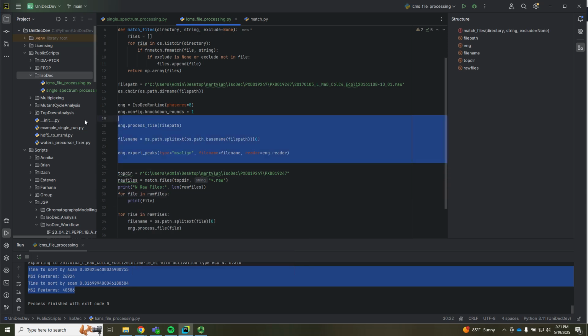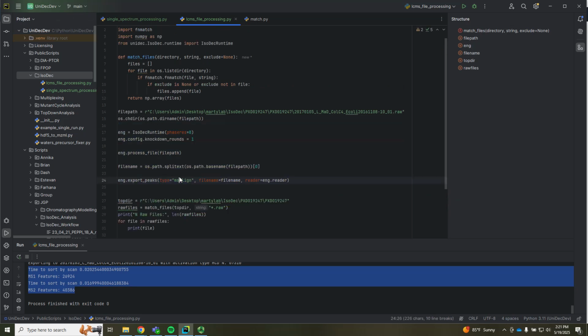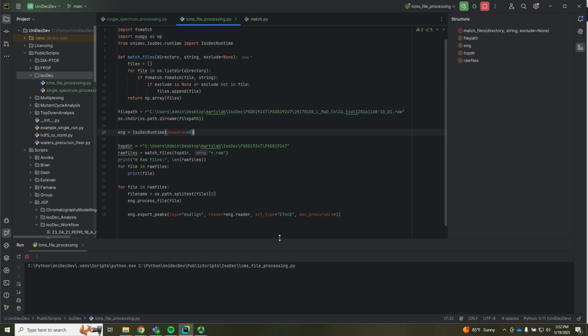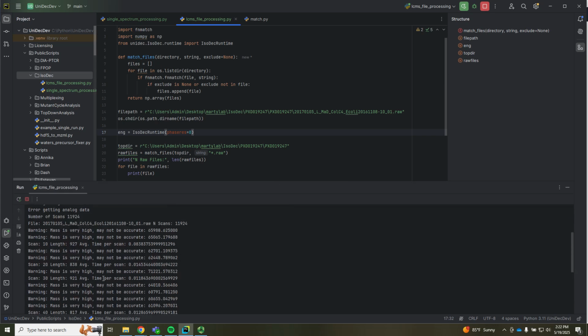So we can delete that now that we've got this all set up. We cannot delete all that because we do not have this all set up. So we need to keep the defined engine, but we should be able to now run this, and assuming, so yeah.